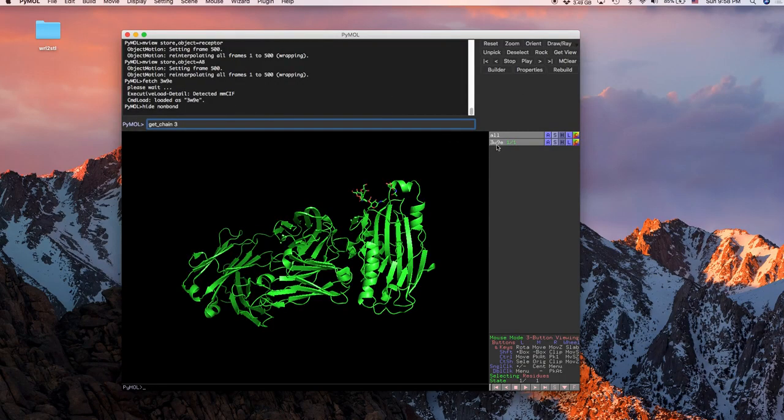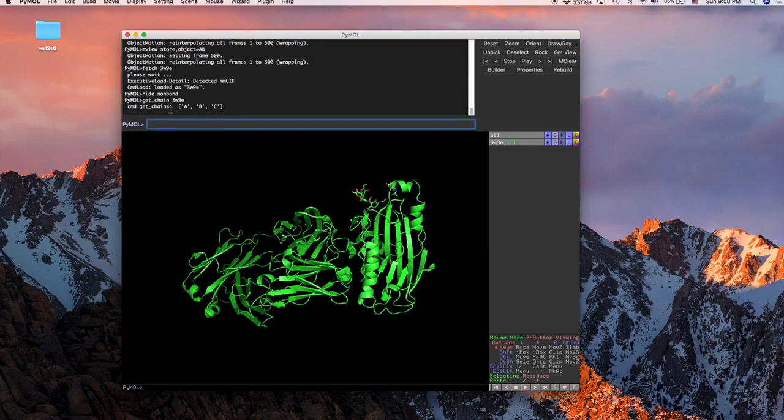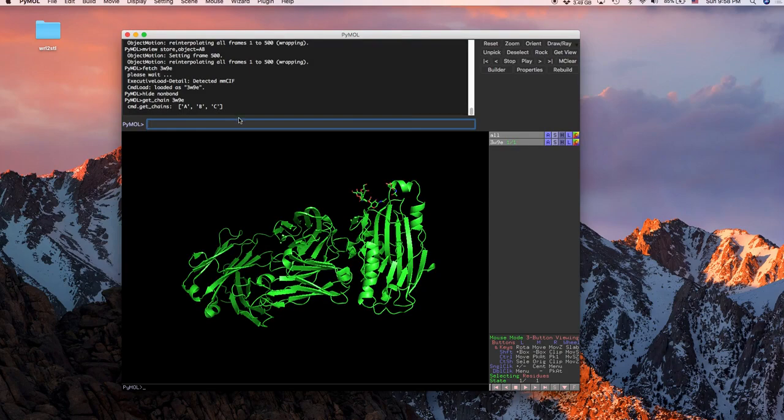So over here is 3w9e, and then here it'll show you that these are the different chains that are in this, so a, b, and c.